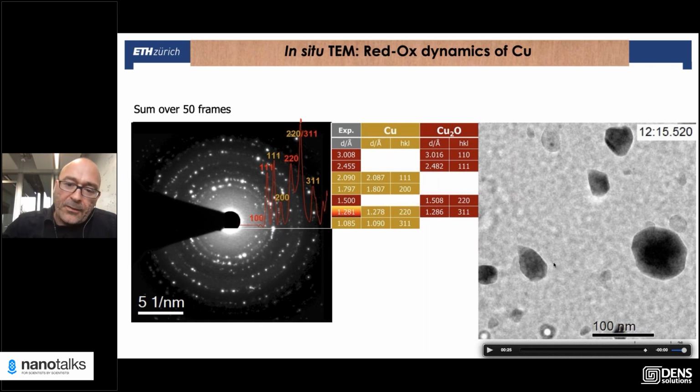In general, in my videos, you will always see that I try not to take high resolution, because as soon as we go too close with too many electrons, we have beam issues. So most of the dynamics I'll look at from a safe distance.